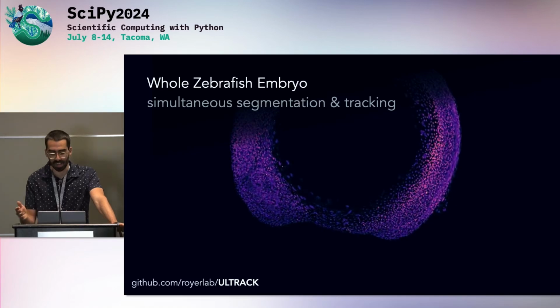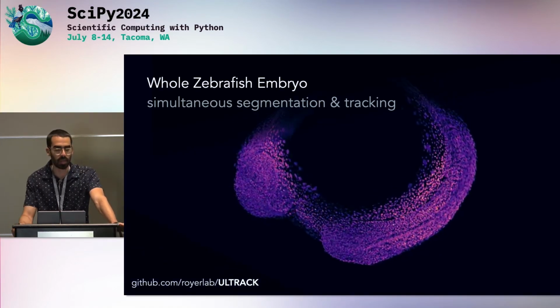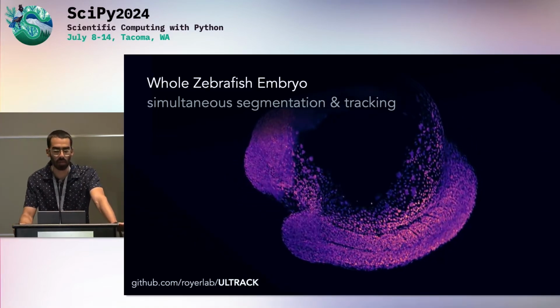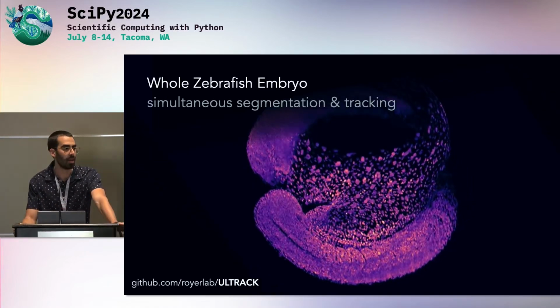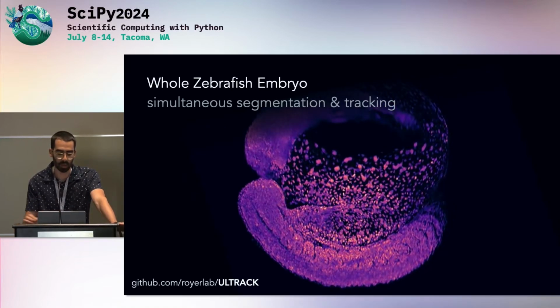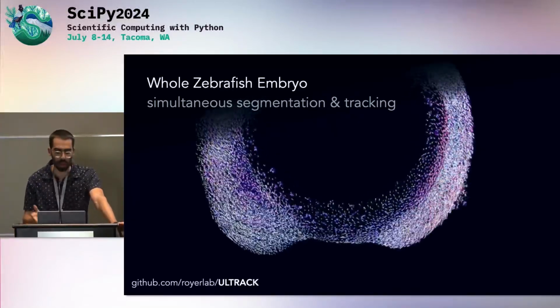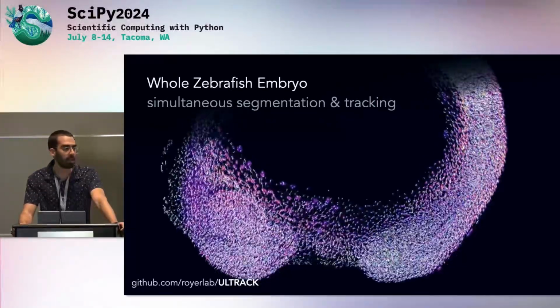But now, I think this was the original work we were developing the tracking for. In our lab, we are imaging the whole zebrafish. So this is a 4 terabyte data set, which spans about 8 hours of zebrafish development. And here you can see how the fish didn't have a very clear structure, but now it's developing the fish head on top, and you can see the fish tail being developed, and these structures, which will become the muscle of the fish. And with this approach, we are able to track all the cells in the embryo. And here we have about 21 million segmentation instances.